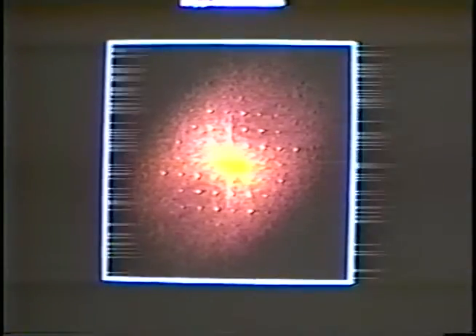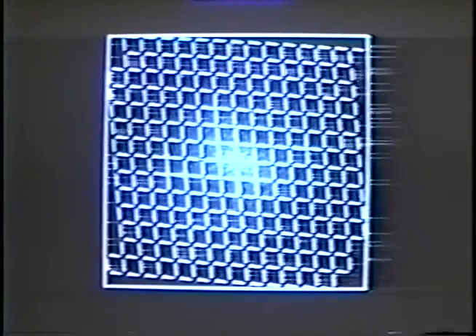The numerical transform is given here. The resolution shown in this numerical transform is 2.1 nanometers. The optical transform, obtained from a slightly larger area of crystallinity, diffracts out to 1.4 nanometers. An example of the index diffraction pattern is given here. The Fourier peak filtered image of the original area selected is shown in this slide.